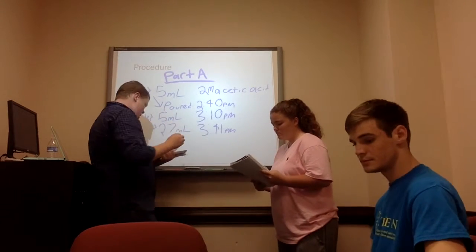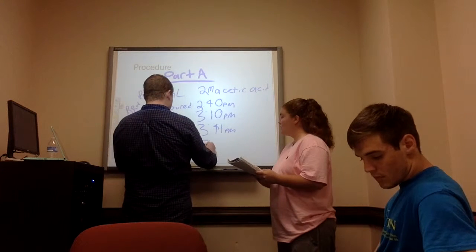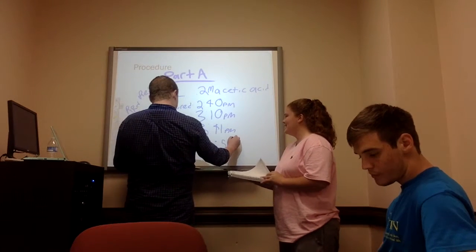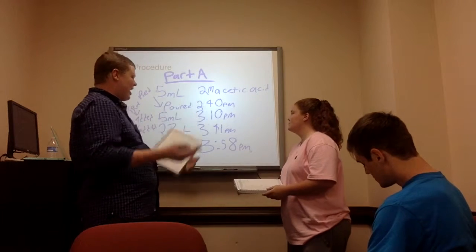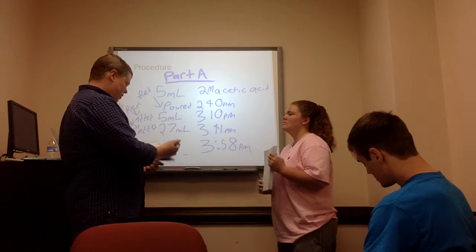Okay. And what time did you call the experiment or call this process? At 3:58 p.m. So it sat there for a total of an hour and 18 minutes and did not fully complete like it was supposed to, correct?